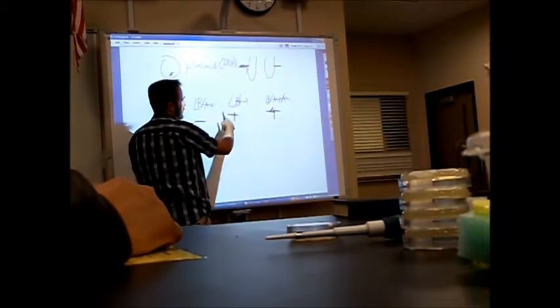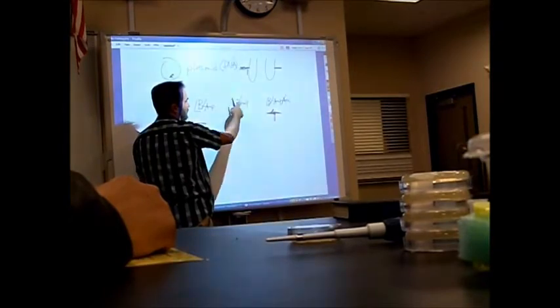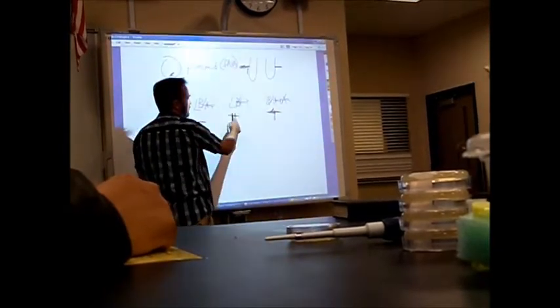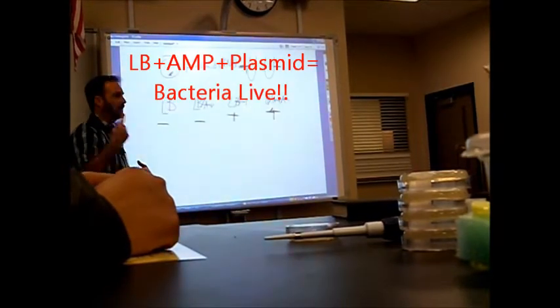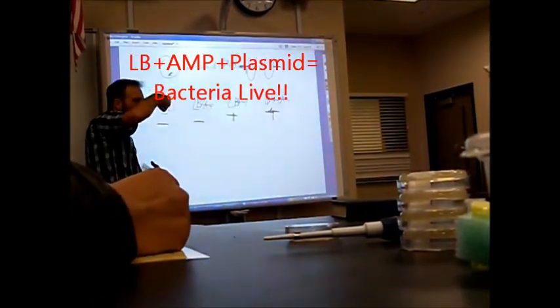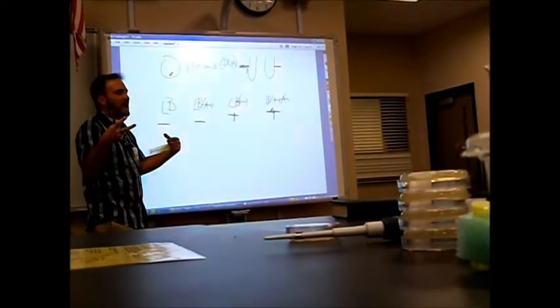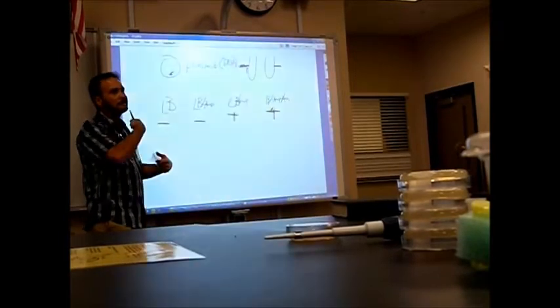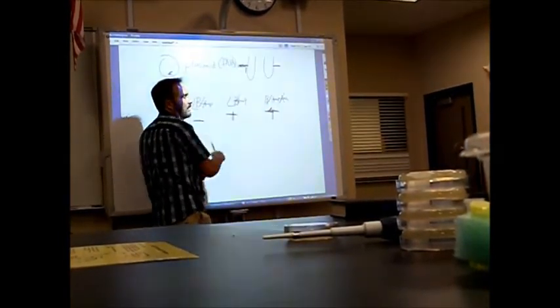How about the bacteria that are here? These now got the special DNA, right? And they're trying to grow on food plus poison. Should they live or die? Live. They should live, right? Because they got the special DNA that tells them how to live in this ampicillin. But there you're going to see just little individual dots because only some of them are going to actually take up the DNA. Anybody who didn't take up the DNA, they're going to die, right? Because there's no way they're going to be able to survive in this ampicillin.